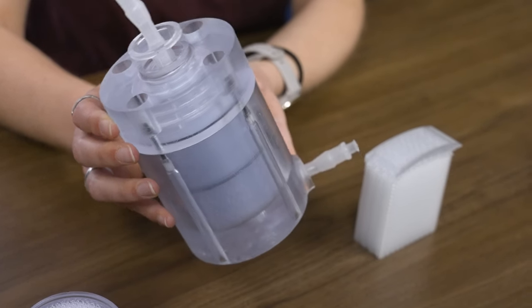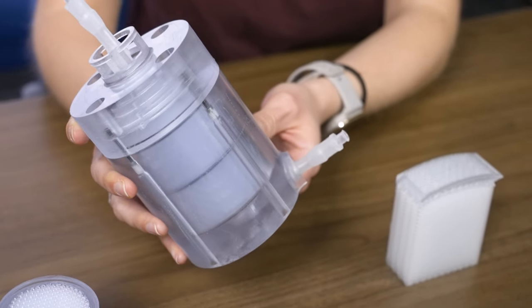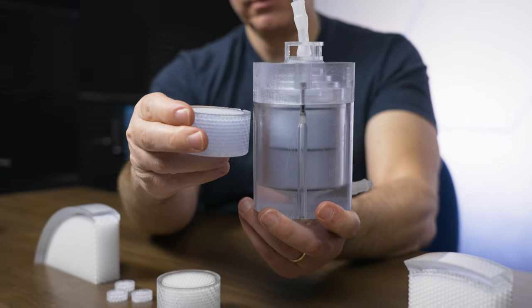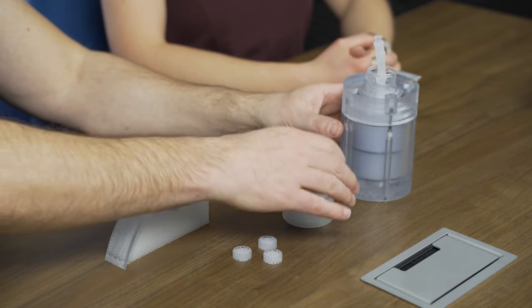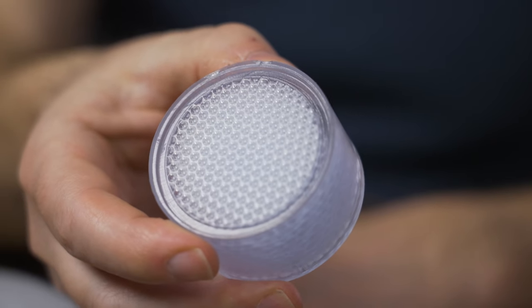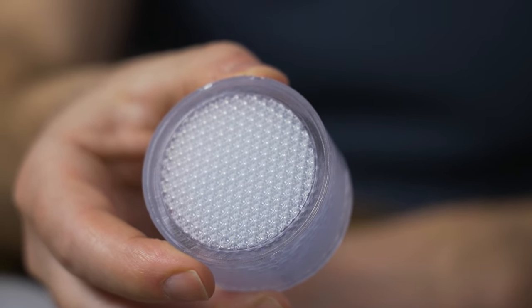Today on the show, we're going to be talking about bioreactors, these chambers that allow you to manage a biological process inside of a closed system. And specifically, we're looking at 3D printed scaffolds that are designed to go inside of bioreactors like this for growing cells. This is the bioreactor. This is a scaffold that goes inside of it.